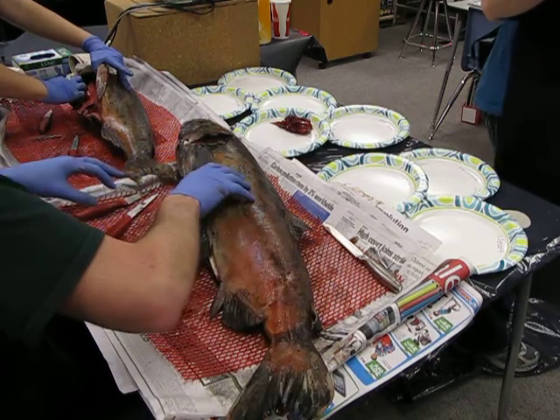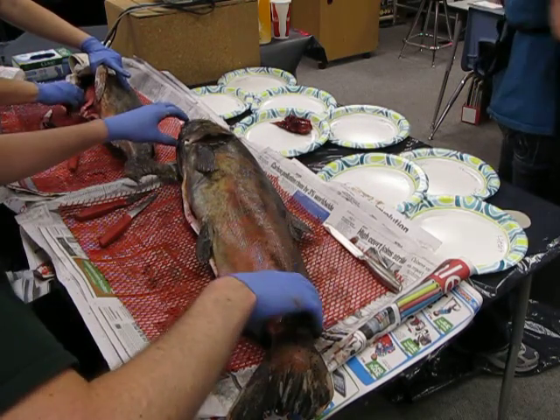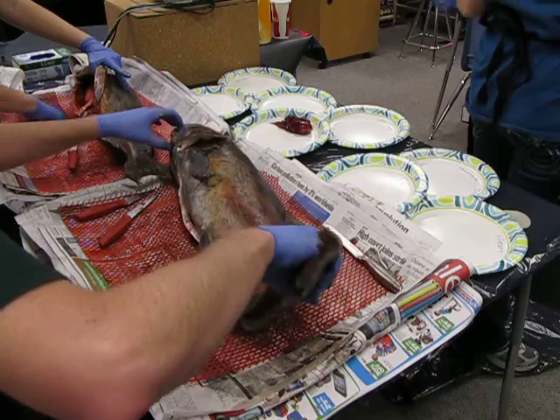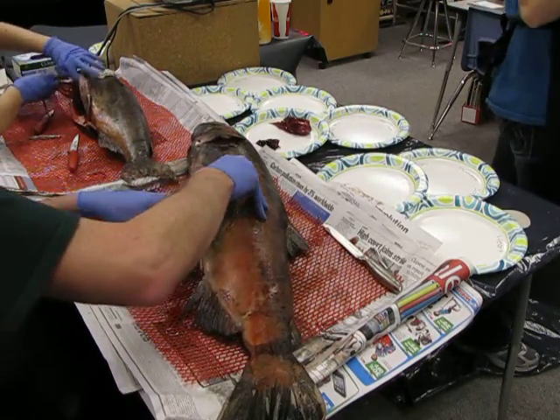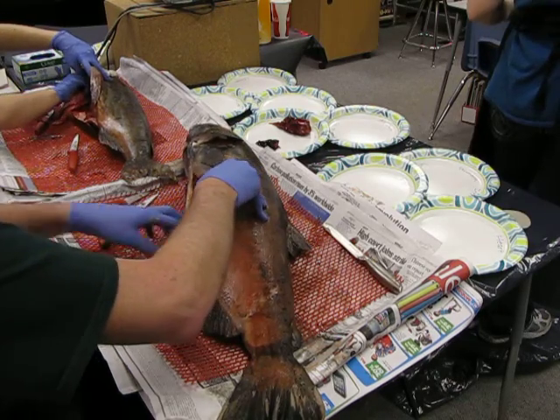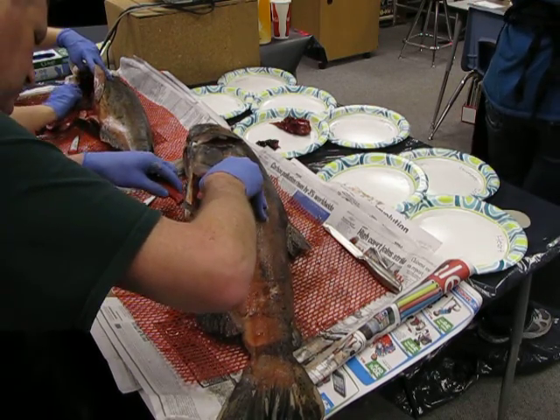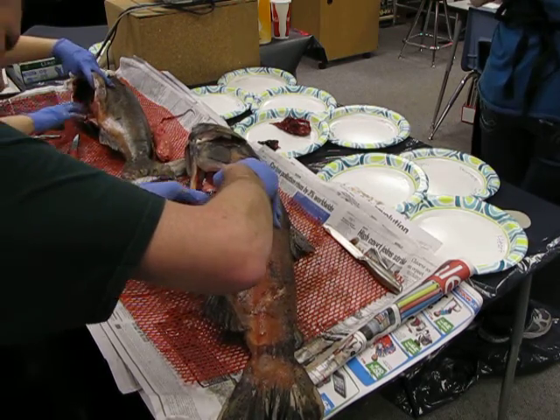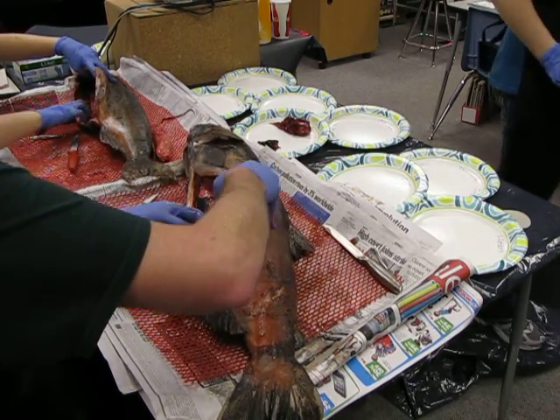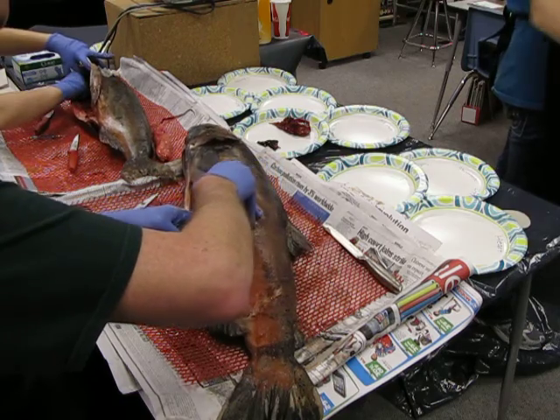So you guys have a pelvis. That's our hip bones. Kind of far away from your head. The pelvic fins are far away from the salmon's head. You guys also have pectoral muscles. Those are our chest muscles. And they're close to our head. So pectoral, like our chest muscles, those fins are close to the salmon's head. The pelvic fins, like our pelvis, our hip bones, are farther away.